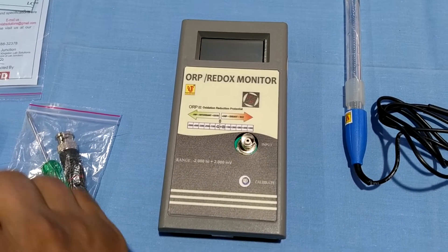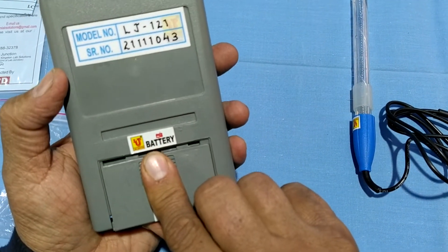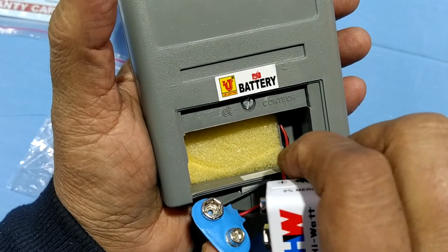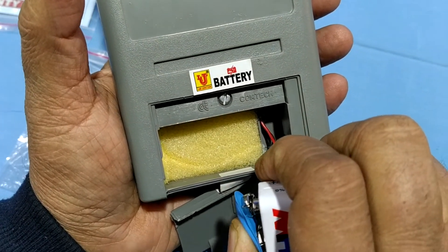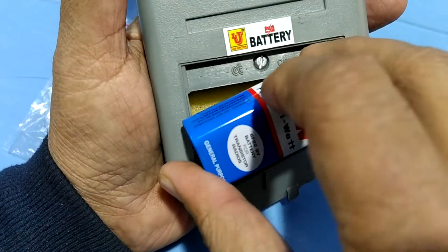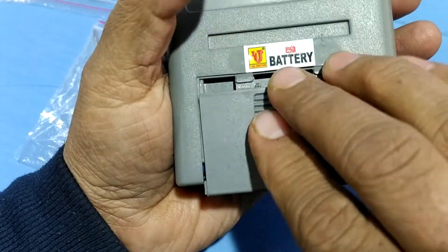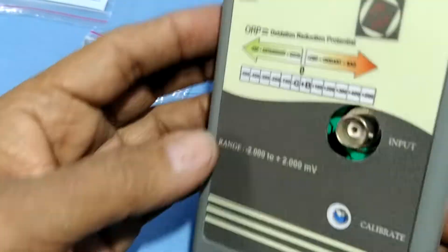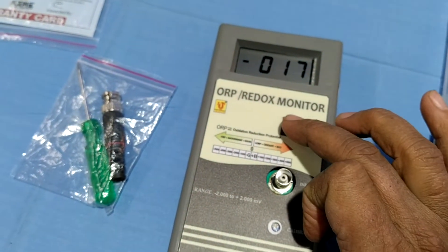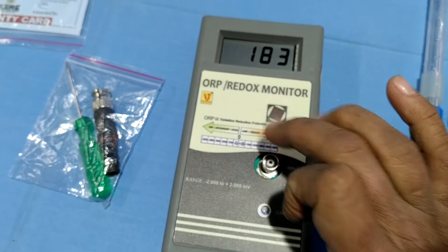First, you have to install the battery in the battery compartment like this. This is switch on, this is switch off.